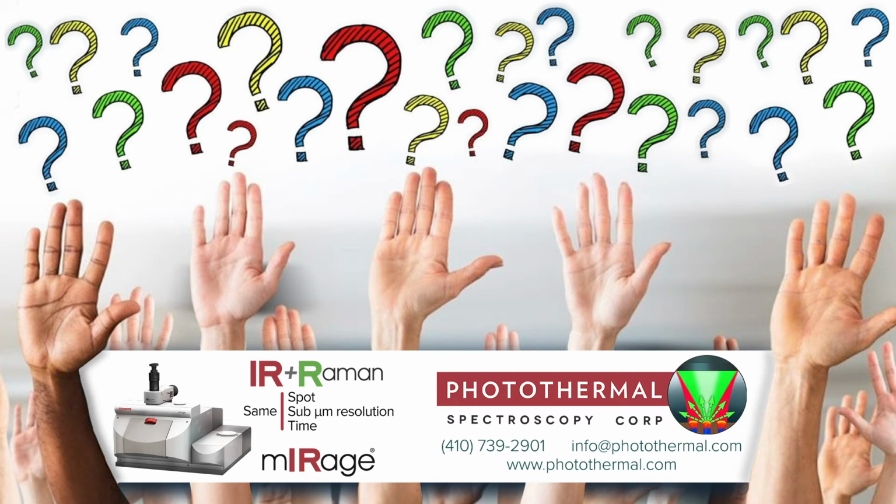So usually, for example, if you use 785, the spectrum is going to be dominated by proteins, lipids, carbohydrates. But if you move to 532, for example, then you will be able to amplify the Raman signatures from molecules that are usually low concentration that you don't see when you use 785. Like cytochromes, because I will show some Raman signatures from cytochromes on the next one. You can see pigments as well. So you can see both. You see all of the Raman spectrum, resonance Raman spectrum.